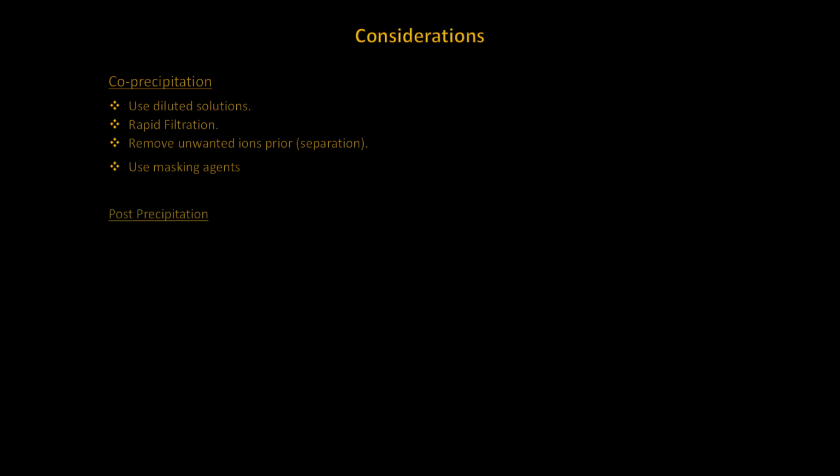Now, if a precipitate is allowed to stand in a solution for too long, the introduction of a contaminant will result. To avoid post-contamination, the precipitate should be washed and filtered as soon as precipitation is complete. Do not let it stand. Due to equilibrium, which will be discussed in a future presentation, as an example, if present, zinc sulfide will precipitate out of a solution and then be absorbed onto the surface of a copper sulfide precipitate, or it will form with it as a post-co-precipitate.